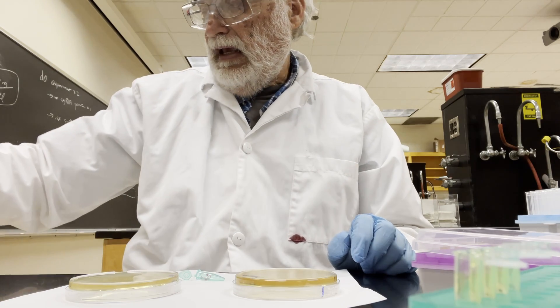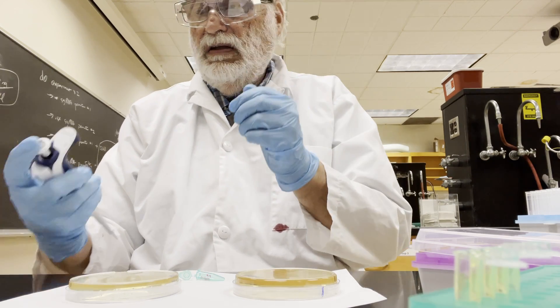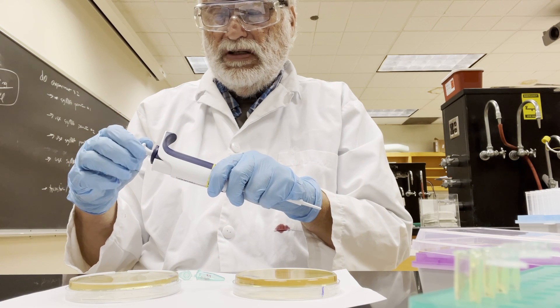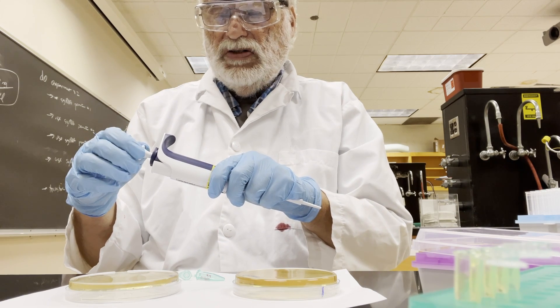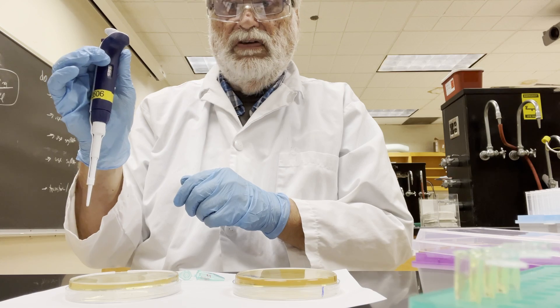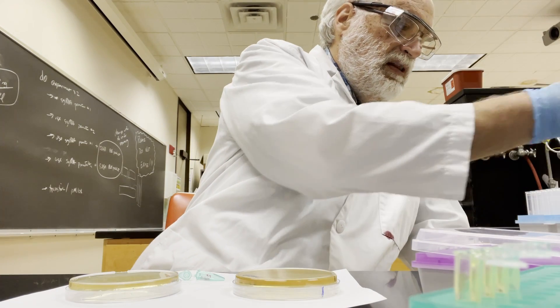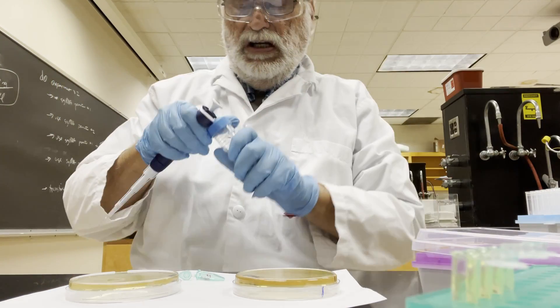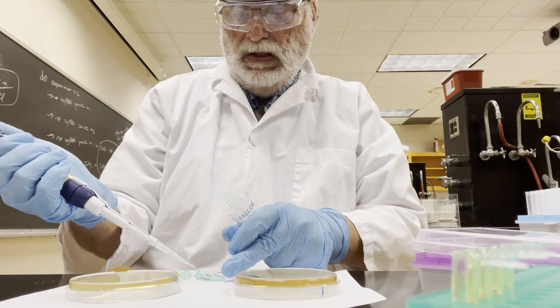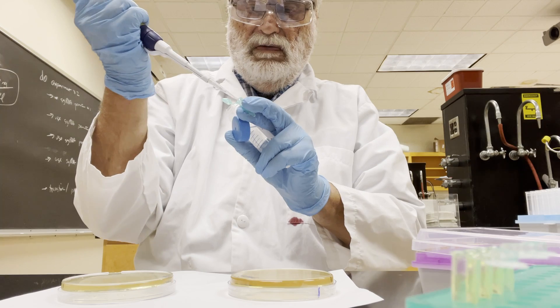I need to put in 1 microliter each of the oligos. I put in 2 microliters total, so I'm going to need to add 23 microliters of water. I don't have a pipette that will do that in one go, so I'll set my P20 to 11.5 and do it twice, making 23 microliters total. I'll go ahead and draw that from my water solution and add it to the tube, then add a second aliquot to the tube.